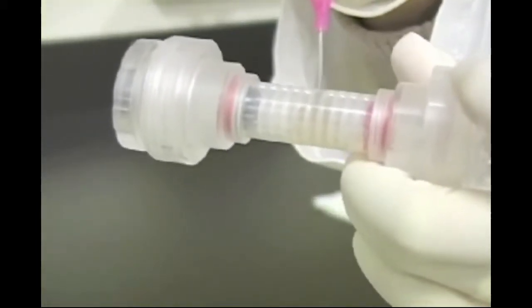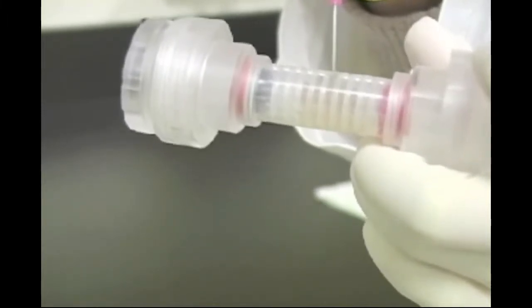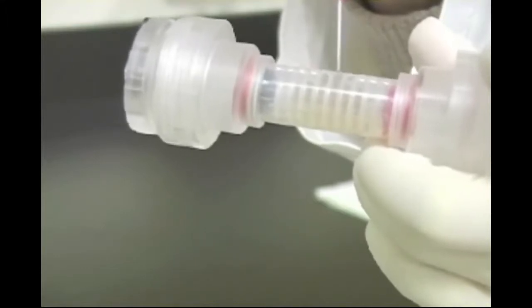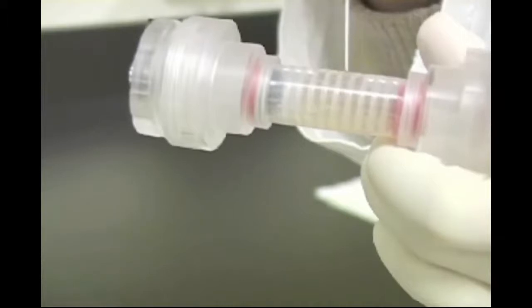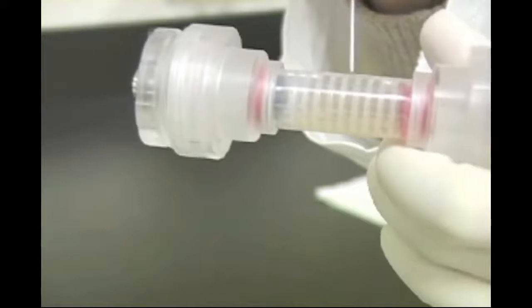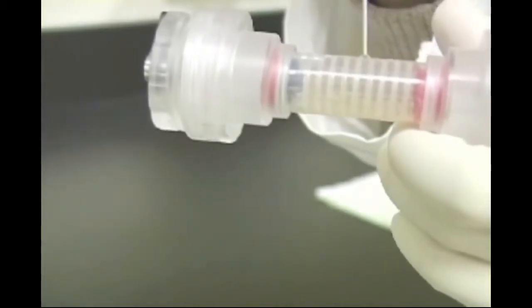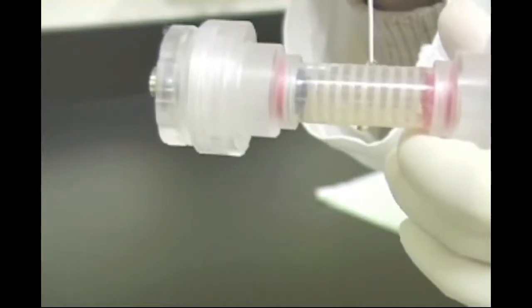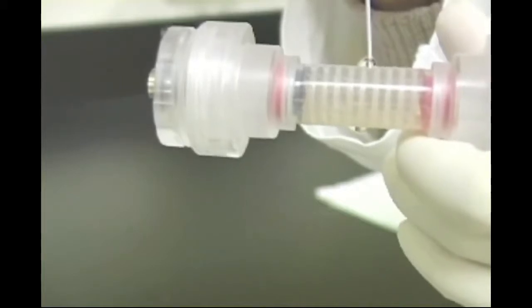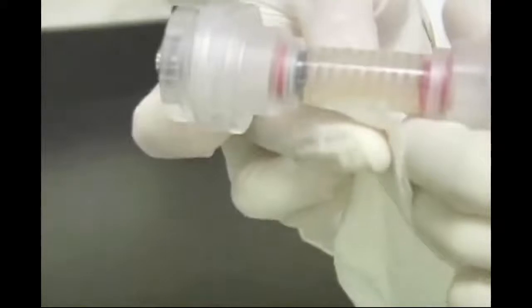Continue adding slowly to this compartment until all of the compartments are filled. When the sample is loaded, dry the outside surface of the focusing chamber and make sure that all compartments are filled and that no bubbles remain. Air bubbles will disrupt the electric field which can lead to poor separation.